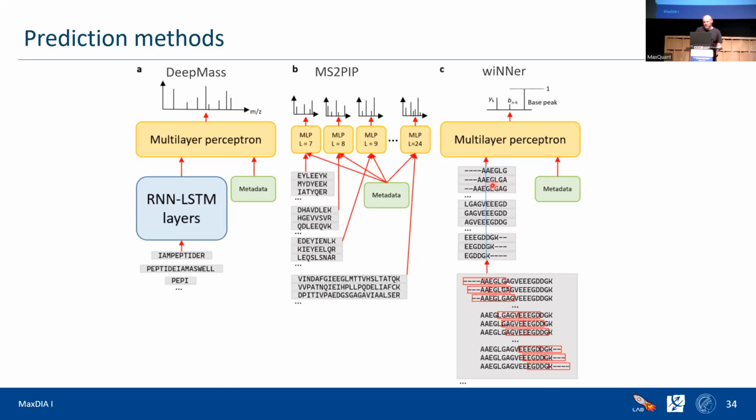So this is a window approach, because you're putting like a sequence window around each bond, and then you move it by one, and so on and so forth. And yeah, so that's what we call this winner. So the NN means this is still a neural network here, but by now this is also replaced by XGBoost.